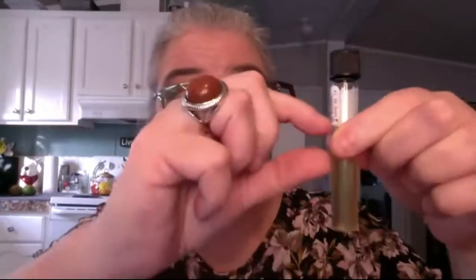Where do you think the Clostridium organism is going to grow in here? As an obligate anaerobe, am I going to find it all the way through, or am I going to see a clump at the top and some strings? Am I going to see a clump at the bottom? What do you think we're going to see? It's an obligate anaerobe.